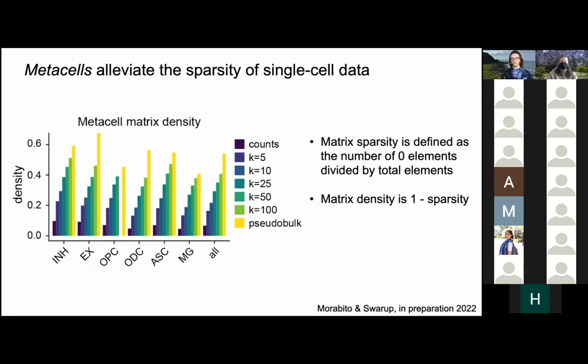Currently, no. We report as output the median number of cells that overlap, and it's pretty much always 0. So the median number is almost always 0, meaning that there's no overlap between the two metacells. There's going to be some overlap, but it's pretty minimal.